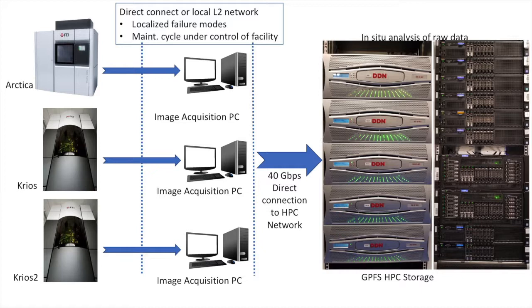So when I saw the suggestion that maybe you push data from the instrument, across the city into a remote facility, I get a little skittish about that. I've just found, at least where I've worked, institutional networks have their flaws, and depending on that, when you have precious samples that you can't run again, can be a risk. So I like the idea of local data collection.